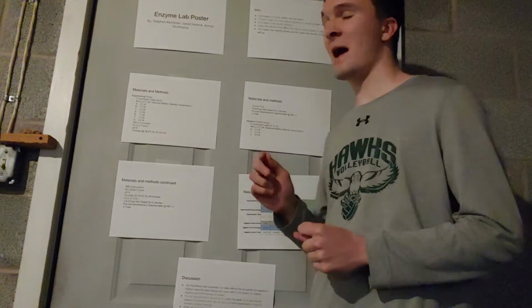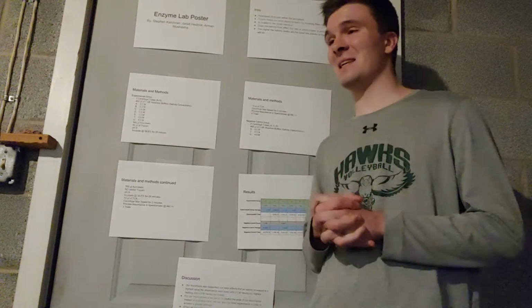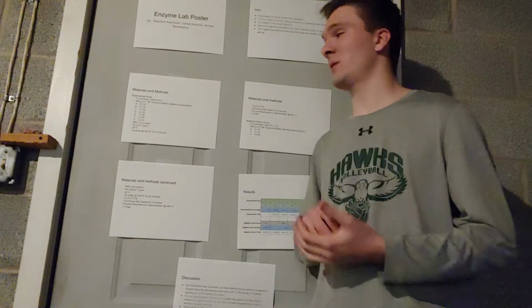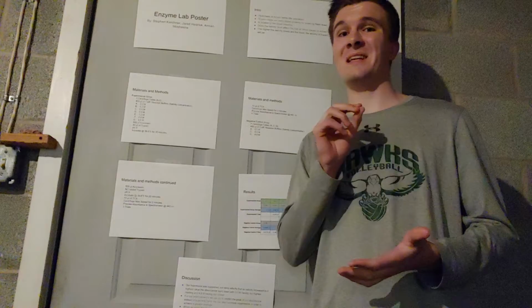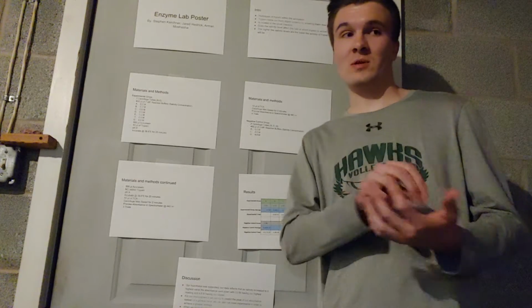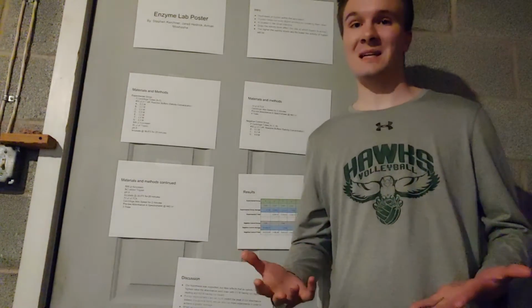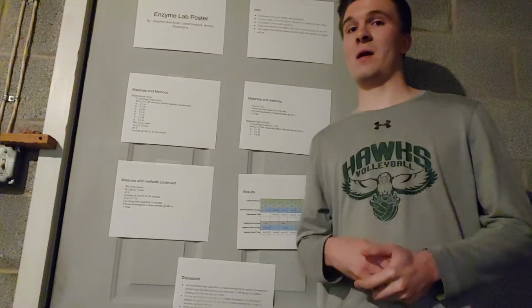So with that, we had to add 500 microliters of the azocasein, and the azocasein in this part is the protein that we are breaking down with trypsin. After the azocasein, we put the trypsin in. We put the trypsin in last, before incubating, so that as soon as we put it in the environment, it is at the exact temperature, which was 38.6, and it is breaking down immediately, and we're not waiting around and losing time.